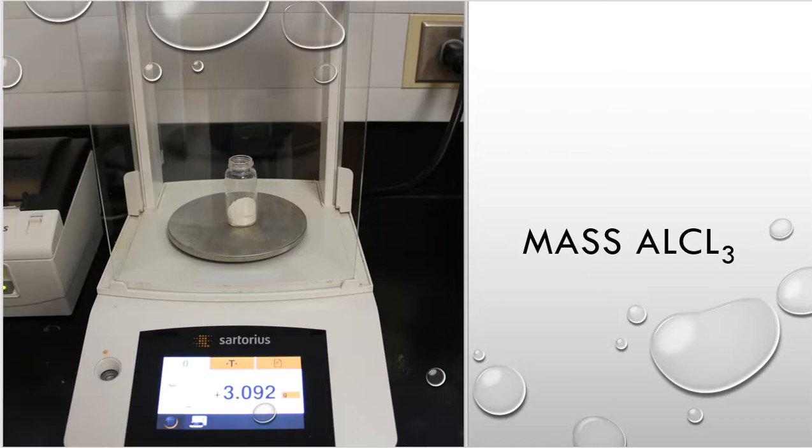Okay, so if we go back to the laboratory procedure, it's going to tell me to weigh out my starting reagents and that kind of thing. So here is the aluminum chloride. That container has been tared already, so that is the mass of the aluminum chloride, 3.092. This is quite a bit, and that's because the lab directions are written for this aluminum chloride to be in a lot of excess. So we have a lot of this that we're going to be adding. Not all of it's required. There'll be way more than enough at the very end, and that's okay. It's just ensuring that enough is there for the actual reaction to take place.